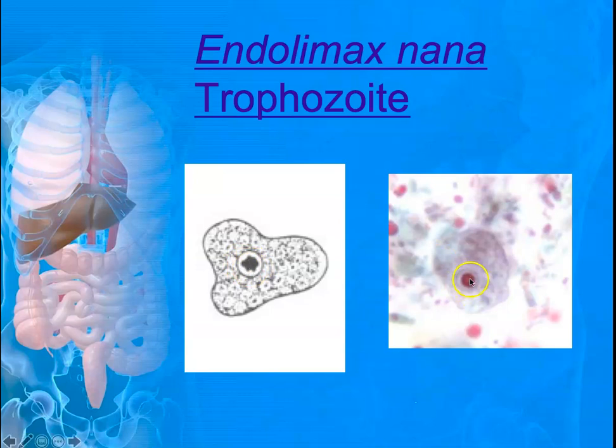Although this one does look nicely circular, they often look sort of bumpy. Now, there's going to be a border for the nucleus, but there's not that peripheral chromatin on the edge like we saw in the previous parasites. So using fine adjustment, it sort of just looks like a clearing or a halo around the nucleus.